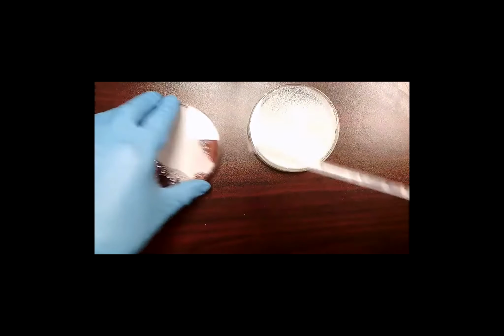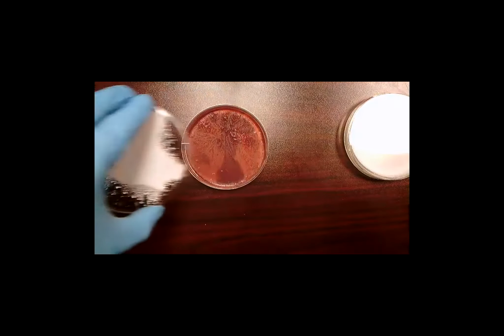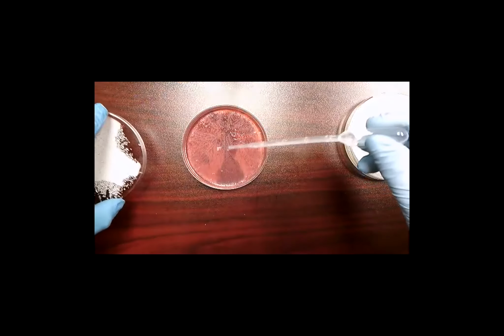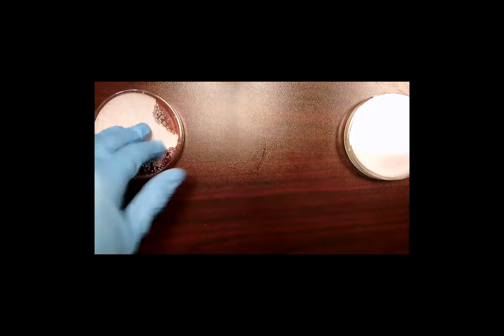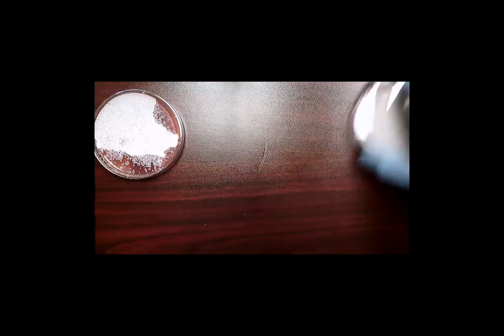Then what you're going to do is you're going to reach down and reach one of your plates. You are going to take the lid off like this, go in the center, and you're just going to drop the water, let it flow, and then immediately take your lid and put it back. And you're going to do that again for your second one. So let's pretend we've already put the water on all our plates that we're doing.